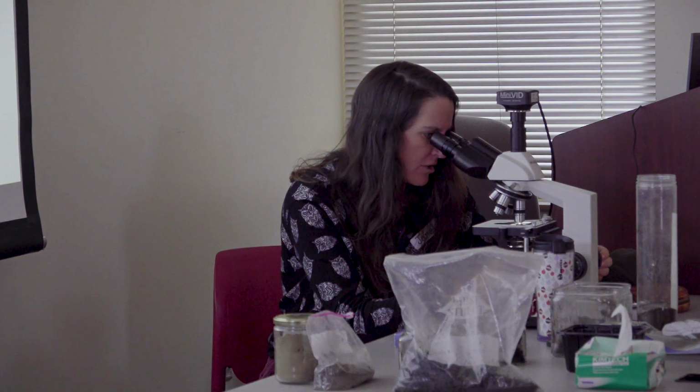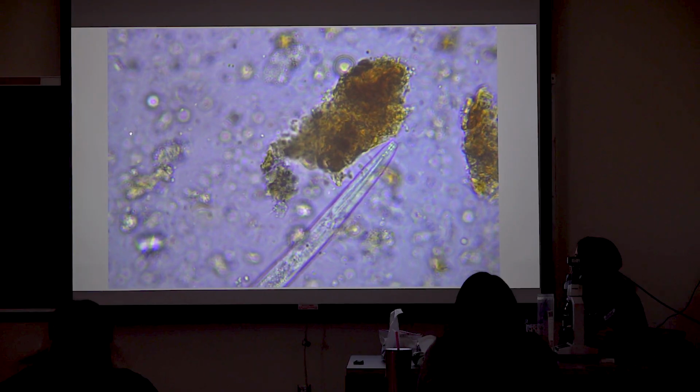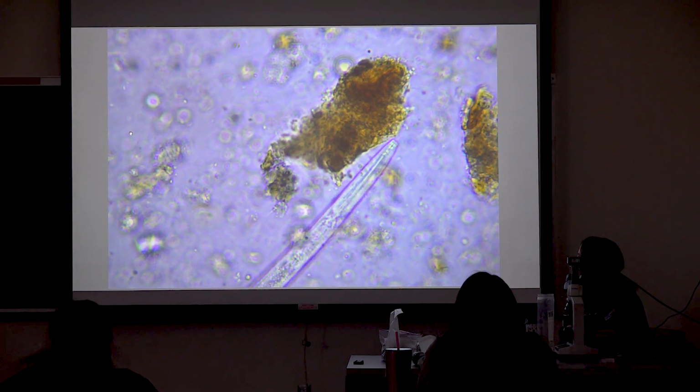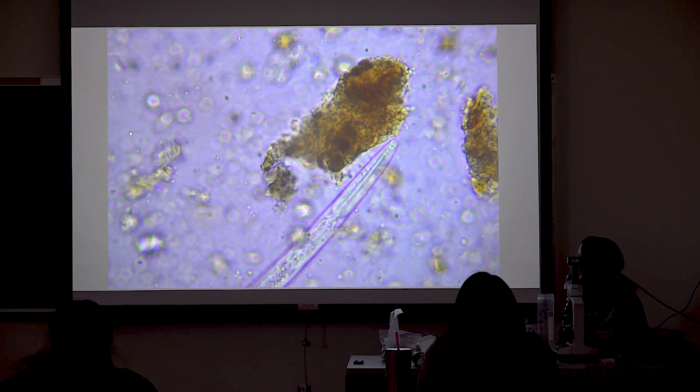Yeah, so we found a nematode. He is not moving. He may not have survived. But they also do nap, so, you know, as we all should.